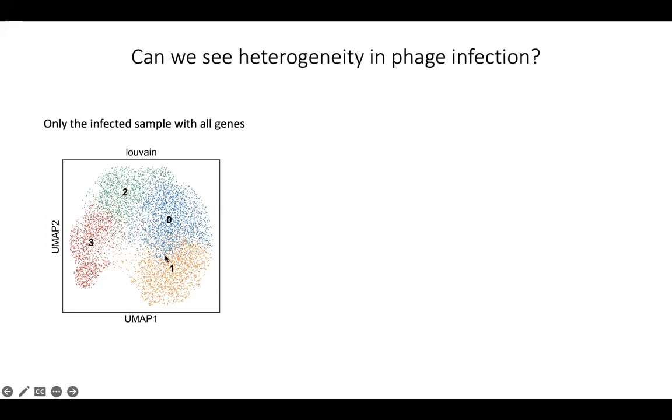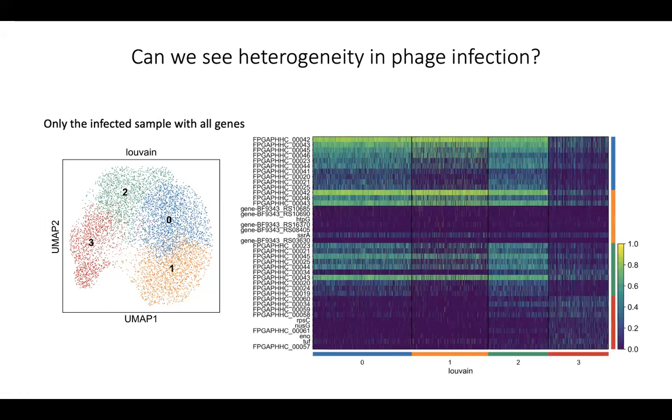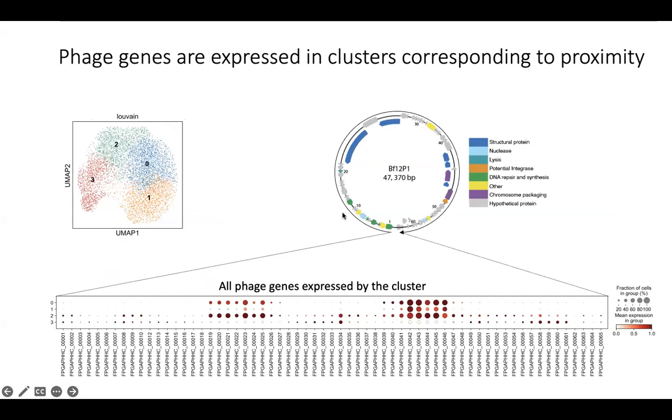And we could find this picture where we see an interesting crescent-shaped structure with 4 different clusters. And the gene expression signature, I'm not going to walk you through this, it's too much. But what is super interesting, I think, is that if we look at the genes from the circular genome of the phage, it only has 65 genes. Okay, it's tiny. And the features that are numbered here from 1 to 65 sequentially are actually grouped on this element according to function.